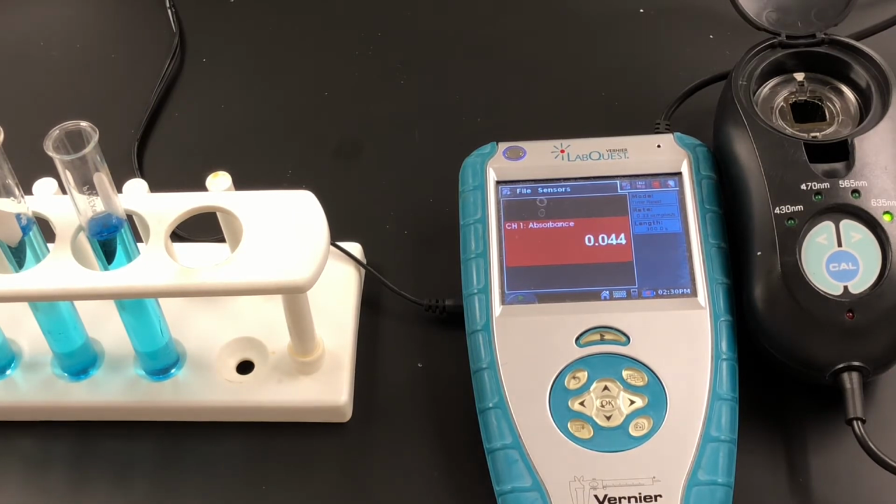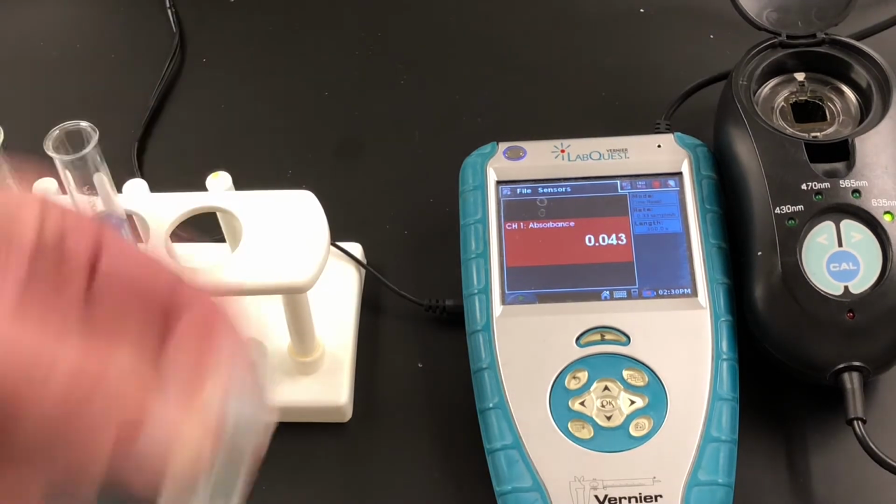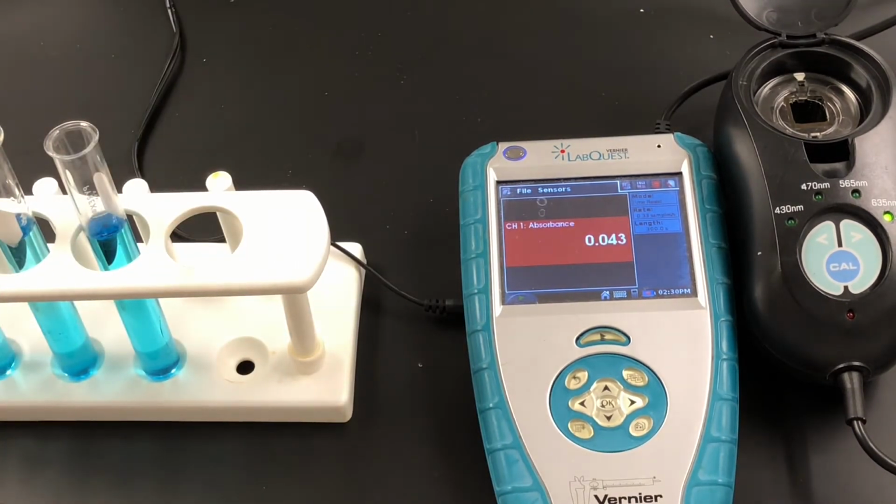Gonna get a sample of the next one now. And what I do to make sure that the sample isn't diluted at all is you take just a little bit and put it in there, shake it up, and then dump that sample out.